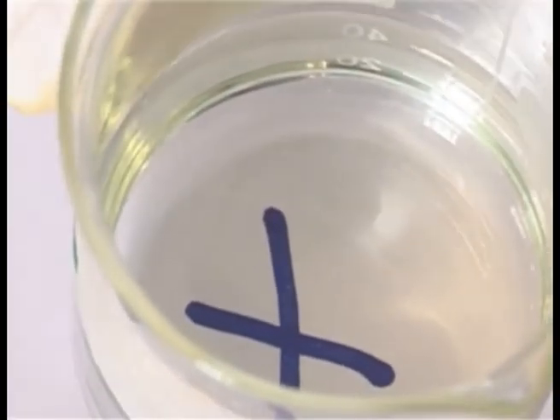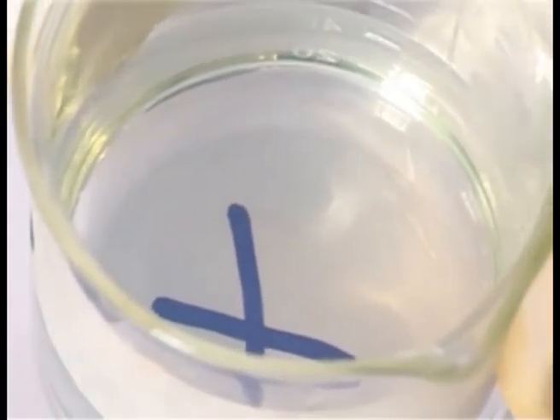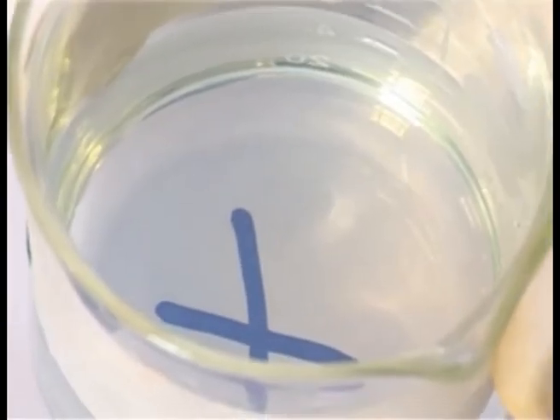Look into the beaker and record the time when the mark disappears.